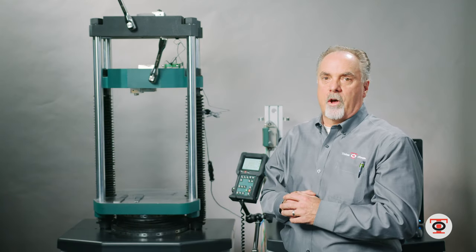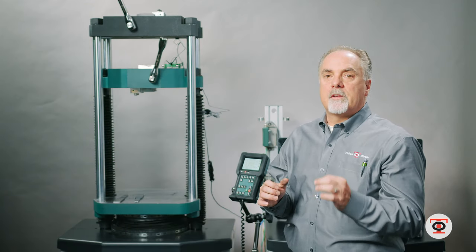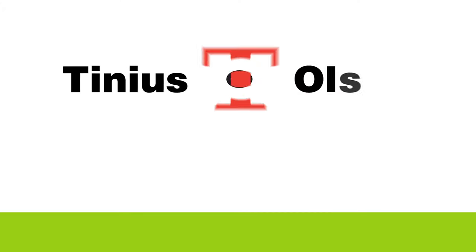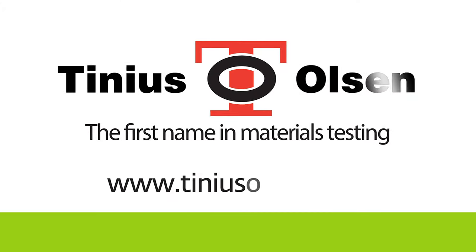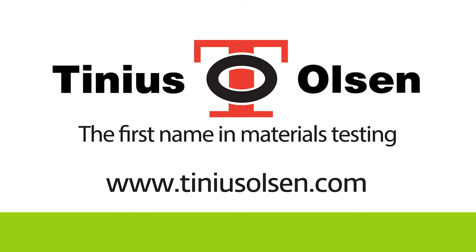Because of the Horizon software, the machine is now ready to run another test.